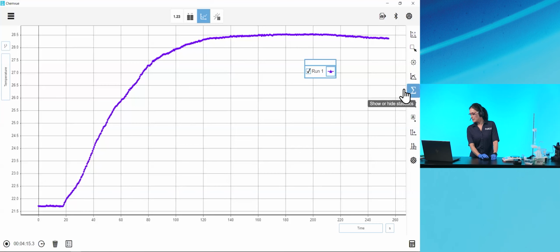So I showed you some stats. If I use the slope point tool, it gives me the change at any individual point. And you can see the black line shows you how much change there is. So there's not much change going on here where the slope has already slowed down. But if I go to where it was changing quickly, you can see that the black line is a lot longer, showing you there's greater change here.